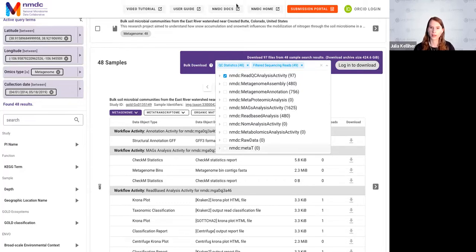So that is a little bit about the NMDC data portal. And I think I only have one last slide for everyone.